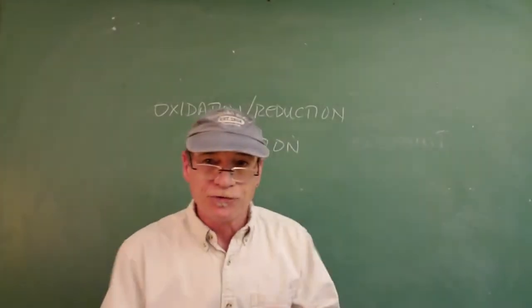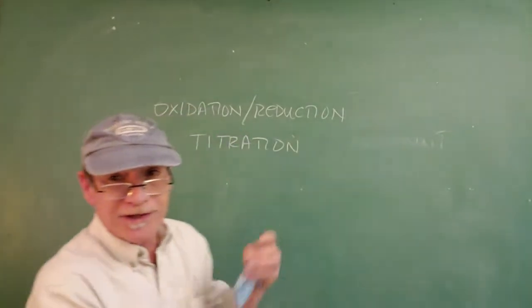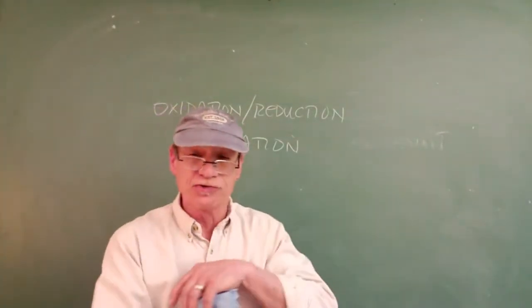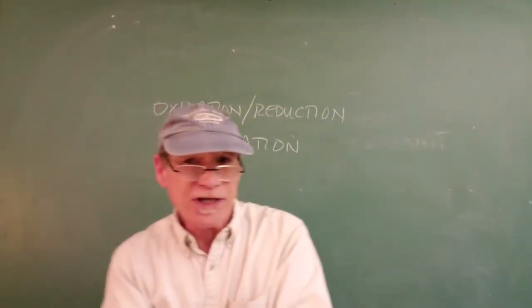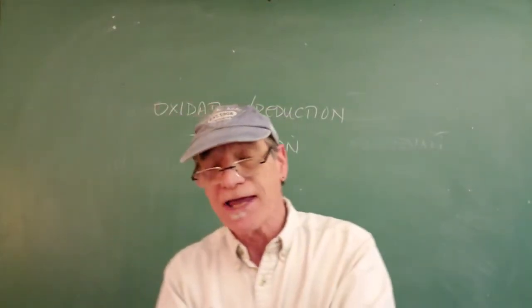Okay, well, our lab that was originally scheduled for this week was going to be an oxidation reduction titration. But we're just going to walk you through the mechanics of what would have happened had we gone to the lab.